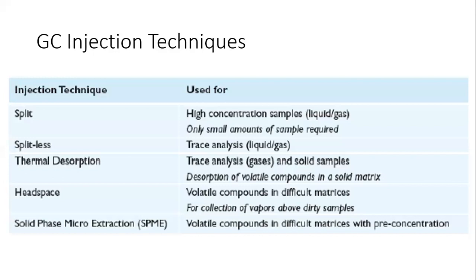However, if you will use an automated GC, you could just prepare your sample and then place it in a vial. Then the autosampler, which will use headspace injection, automatically gets the sample from the sample solution in the vial.